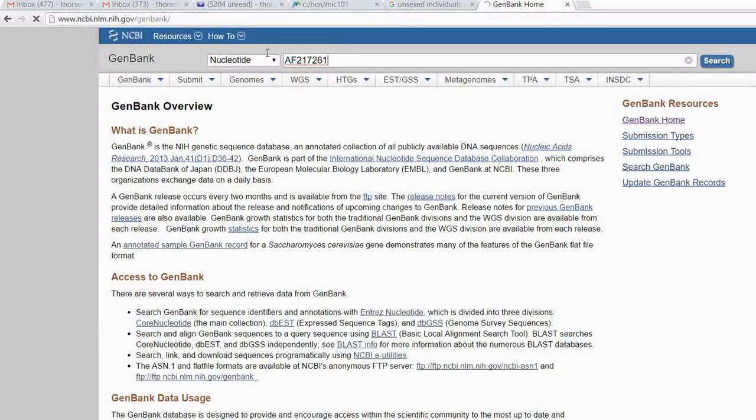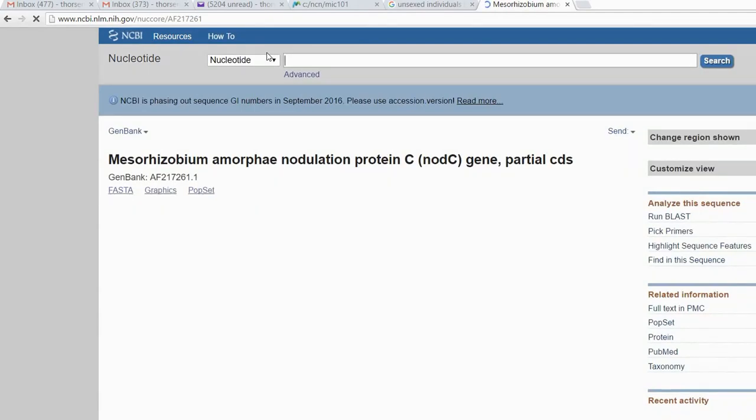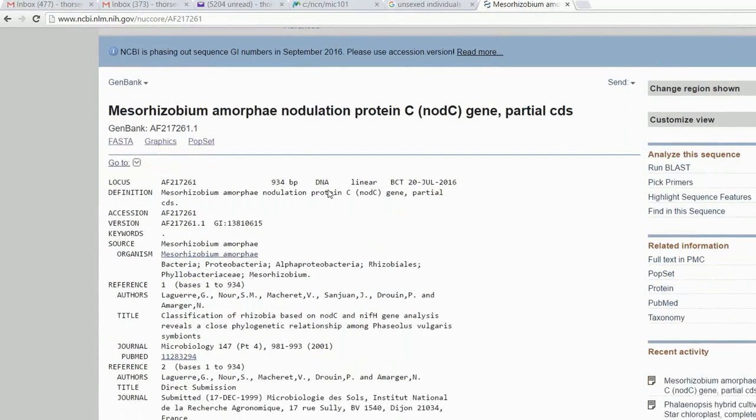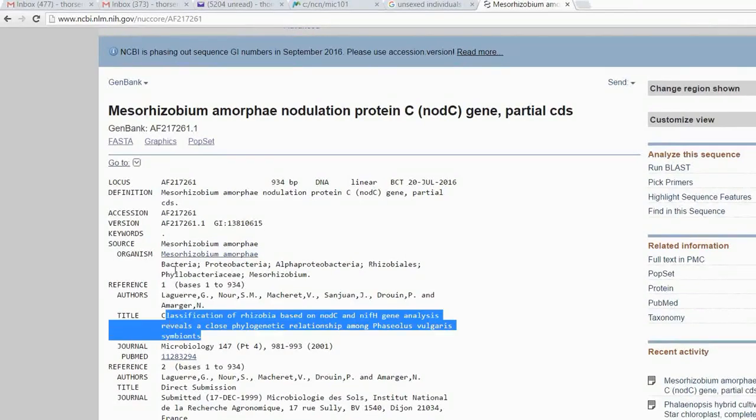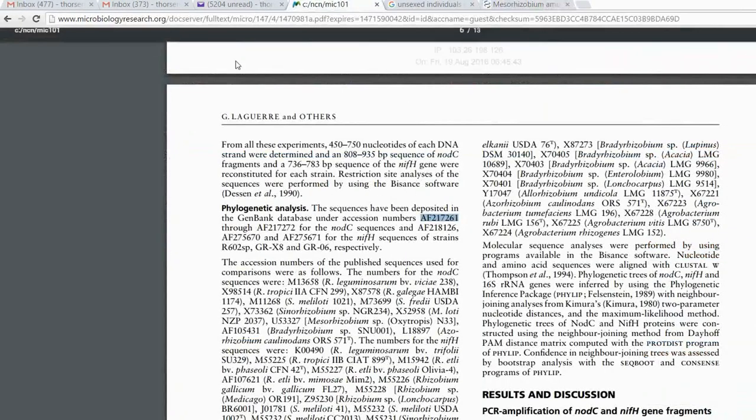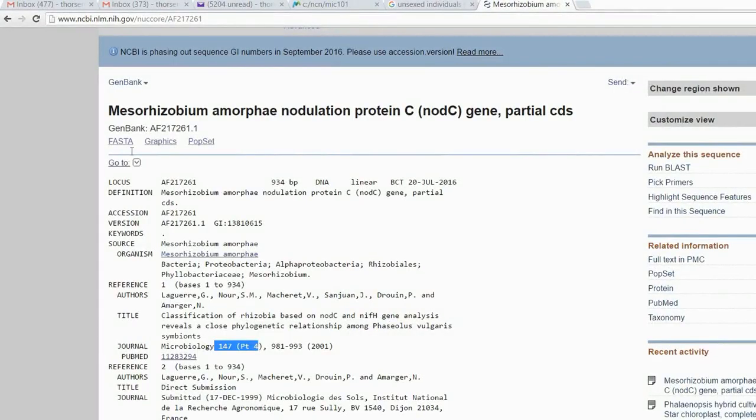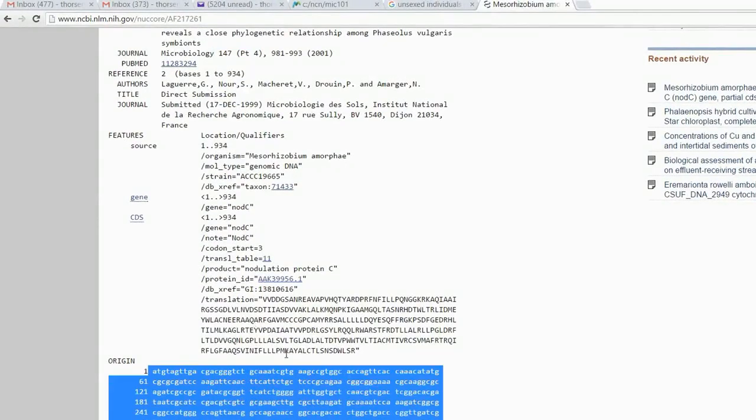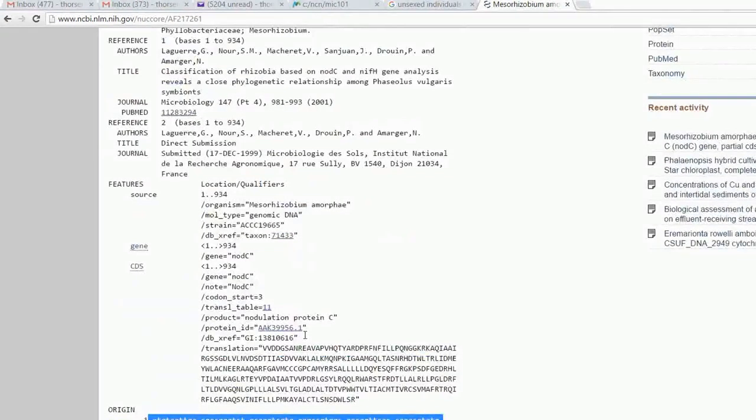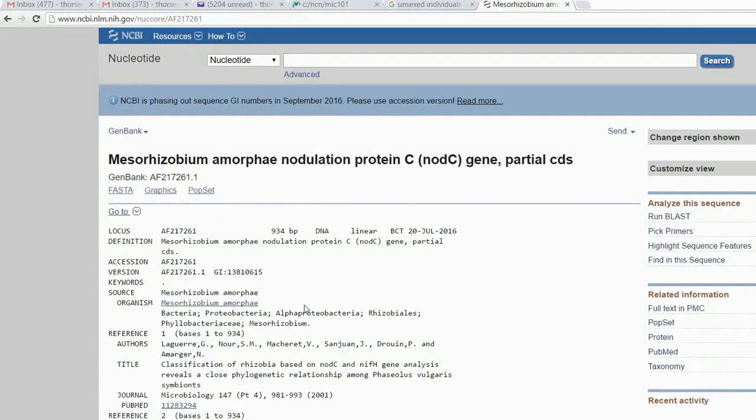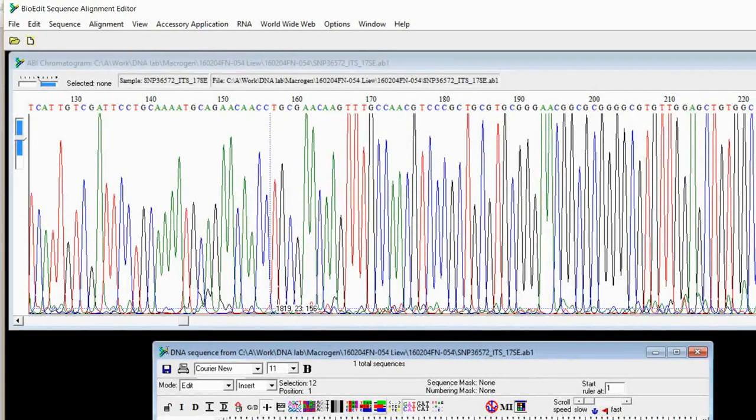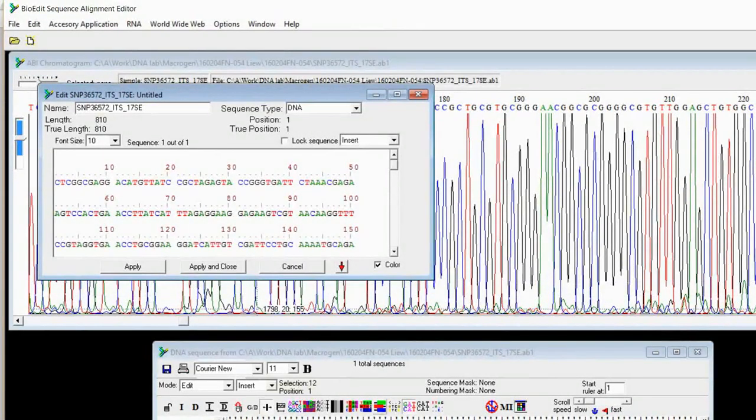For example, you have a number just now, right? Let's say this one. If you search for it, then you can find the sequence. Where is it from? Where is it published? Which journal? Exactly this one, same as this one. From which species this sequence came from? The sequence. Everything is here.